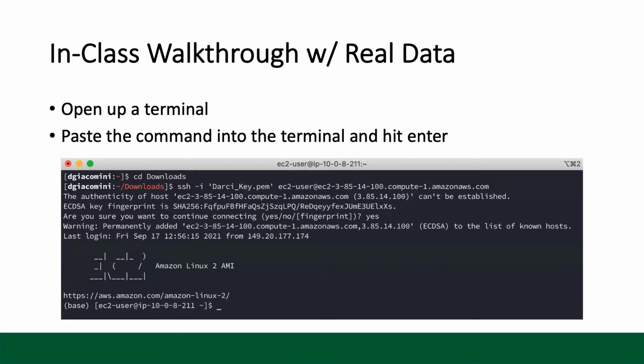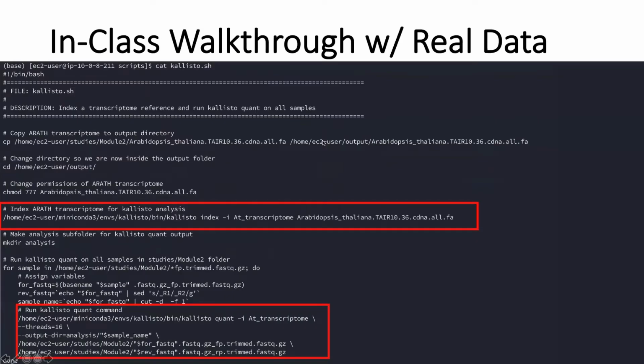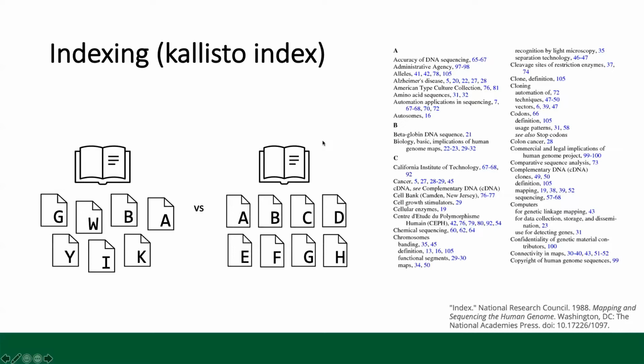Okay. So this is what we've done so far. We started to run that command, and as expected, the output appears. Just to explain a little better what we mean when we say it's indexing.